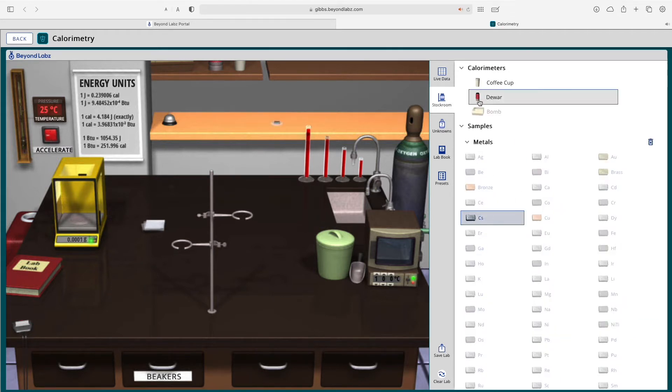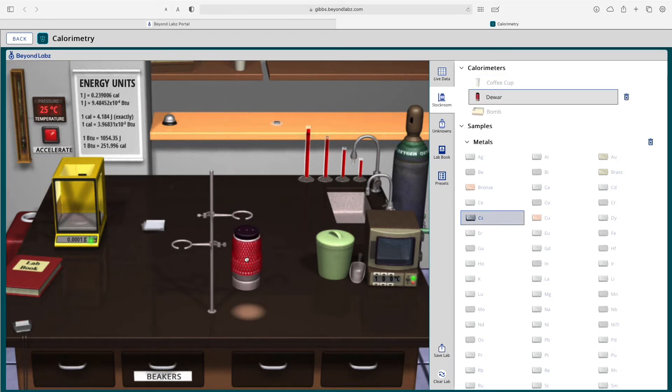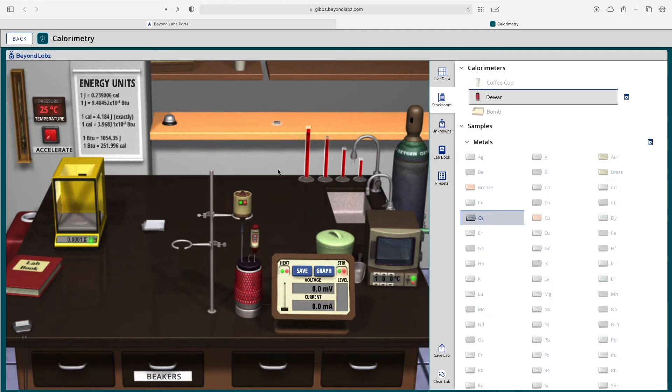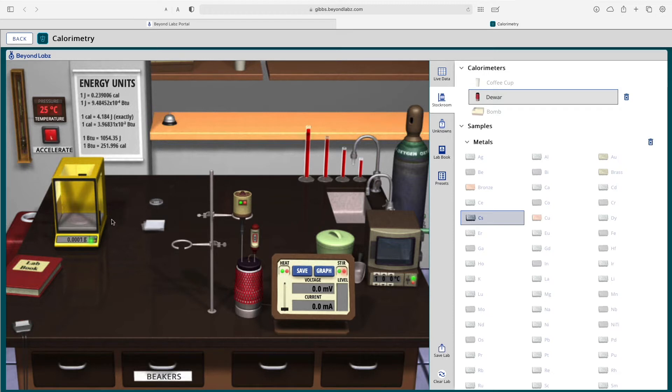So for example, if I wanted to select a metal, then I could select a calorimeter and drag that calorimeter to the benchtop, drag the metal over to the balance if I wanted to, or any of the compounds, the salts, the organics.